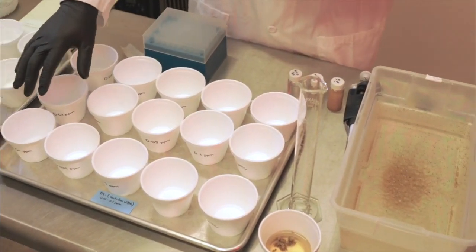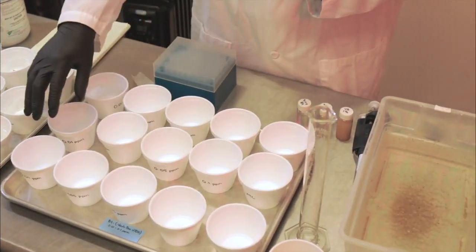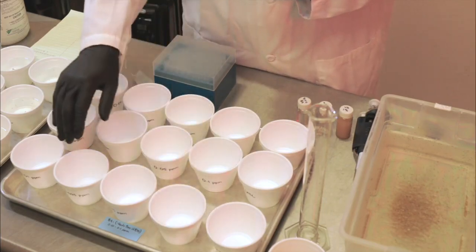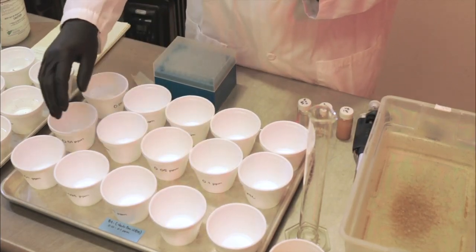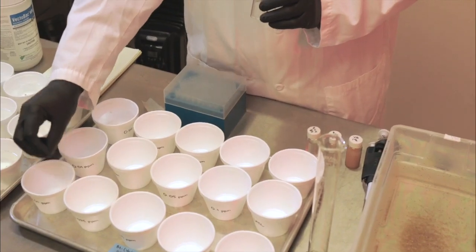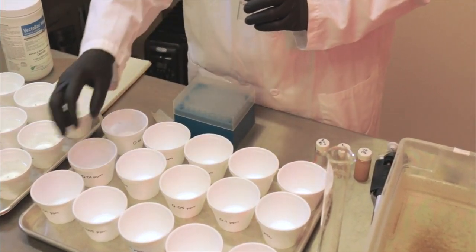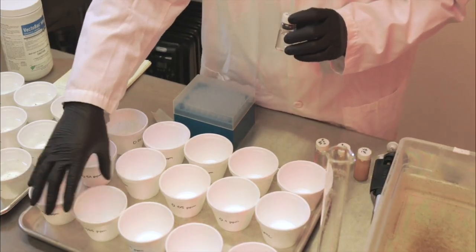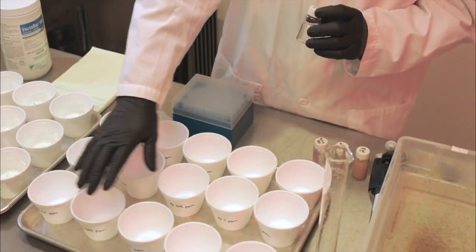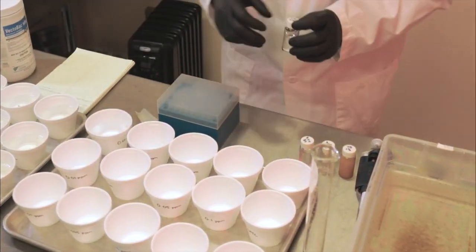As you can see, the range is 0.1 to 1 ml in the 100 ml. That's the range I try to control, without consideration of the small amount going into the 100 ml. We kind of ignore the difference of the added part to the total volume, before and after. So we still consider it a 100 ml after this addition of treatment material.